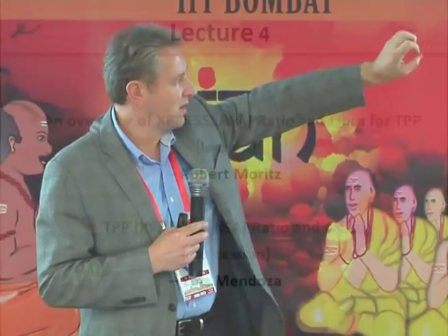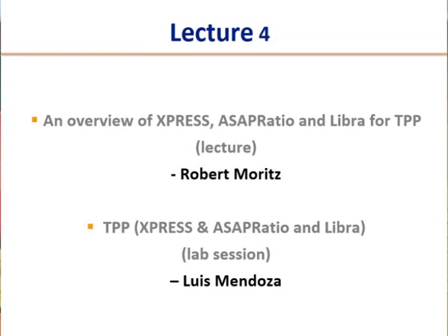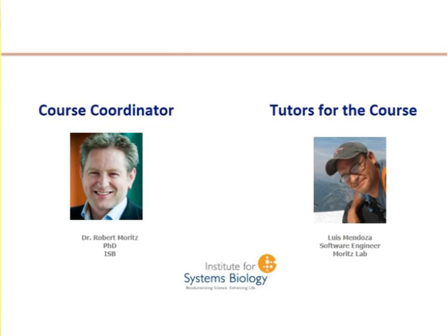We will spend the rest of the afternoon talking about quantitation, the tools that we have, some of the tools that have been there for quite some time. That will continue tomorrow morning with a new tool that's currently being built inside the TPP, called St. Peter. And that'll be talked about tomorrow morning. Luis will spend the rest of the afternoon with you, so he'll entertain you for all of that.